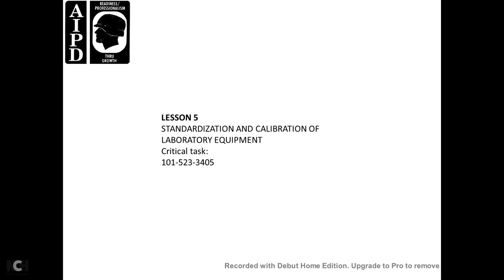All right, Lesson 5: Standardization and Calibration of Laboratory Equipment. Critical task.